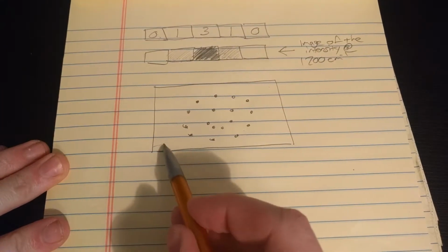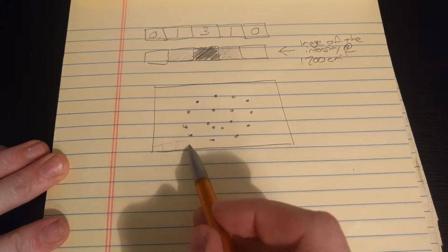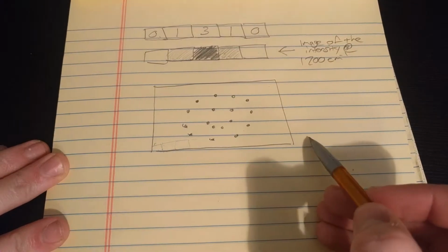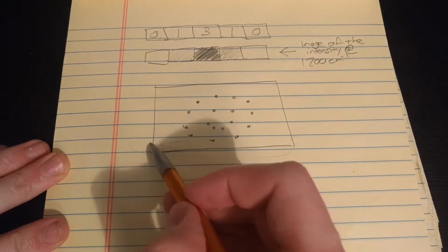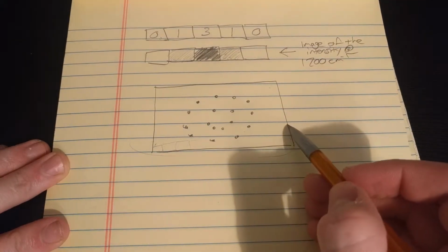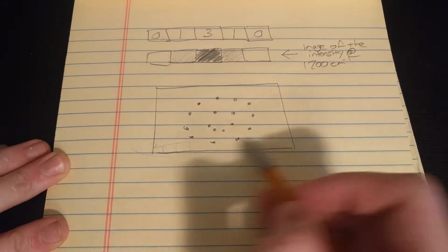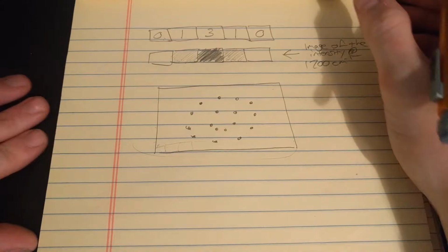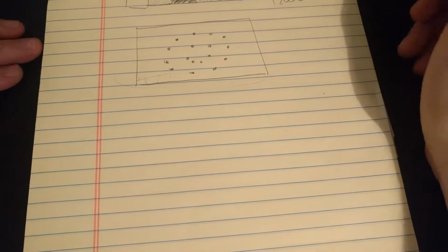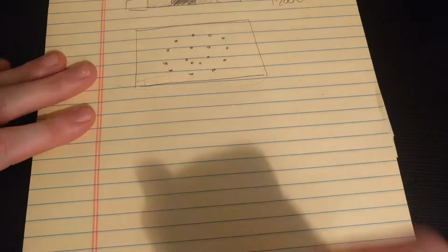and then we move our laser over here, and then we move it over here, and we can do that many, many times, and once we reach the end, we move our laser over here, do it again, move up a row, do it again, and so on and so forth. And we can collect many, many spectra, and we do the same process we just did, and we might end up with something like the following.